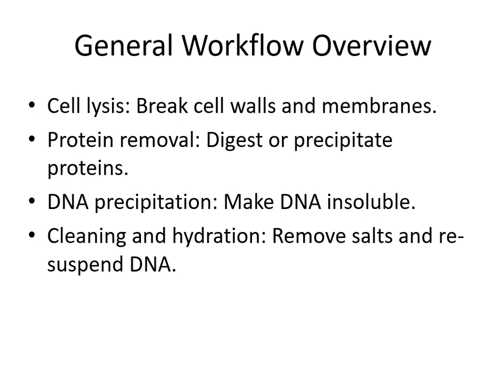The general workflow of DNA extraction includes cell lysis, in which, depending upon the morphology, it is necessary to break the cell wall and membrane to make the DNA efficient to release. So it is necessary to remove the unwanted proteins in these cells to get DNA. So it is necessary to do precipitation or digestion of the proteins present in the cell.